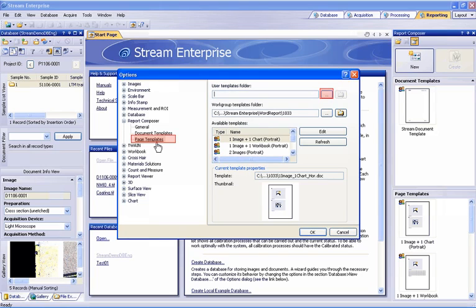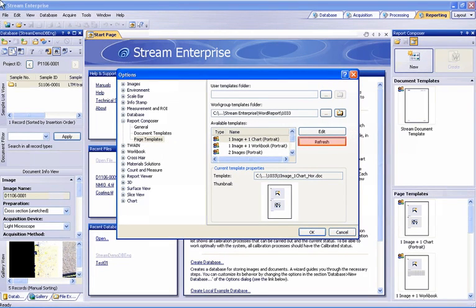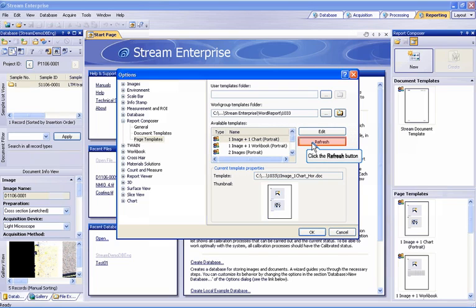You will have to point to a folder location where you have your personal template saved by selecting the Browse button. For this demonstration, the new page template we created was saved within the Workgroup Templates folder. You will have to press the Refresh button to have the software automatically populate the available templates list with the new template.